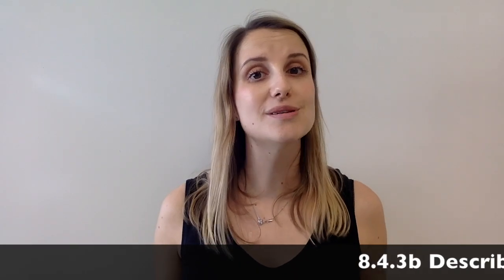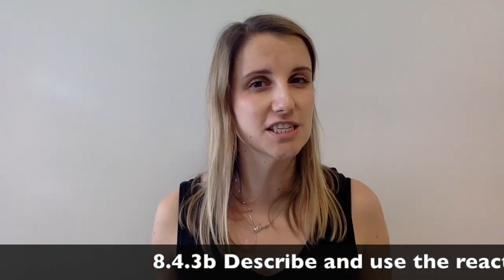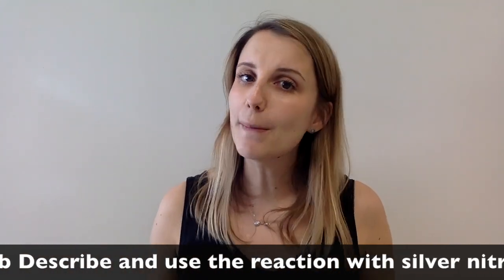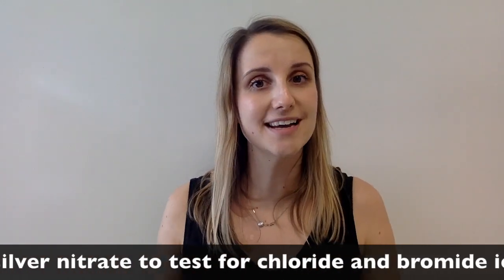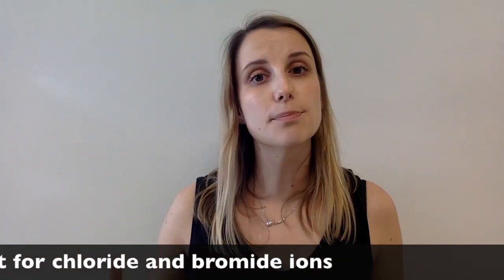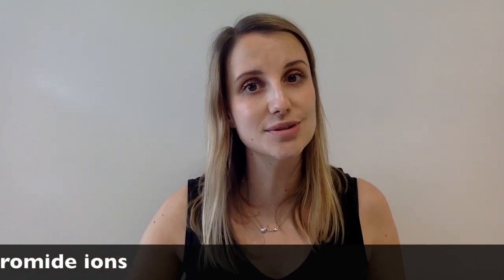If you're getting confused about which of the products is responsible for the precipitate, just remember what you're testing for. In this case, you're testing for bromide and chloride. So that means the product that contains those has got to be the one that's causing the precipitate.